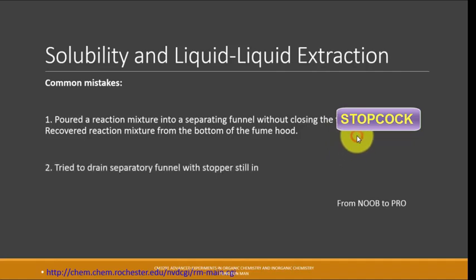Another mistake that I see is they try to drain the separation funnel with the stopper still in. So they shake it, right? Extract, and then the stopper is on top, and then they try to open the stopcock and drain, but it is not moving. They don't realize that the top is sealing it, creating a mini vacuum. So you need to open the stopper and then turn the stopcock, allowing the liquid to flow down.